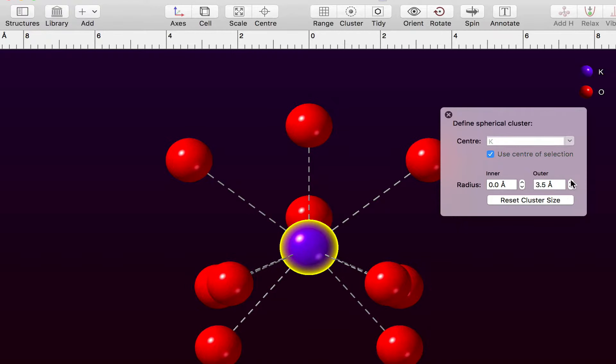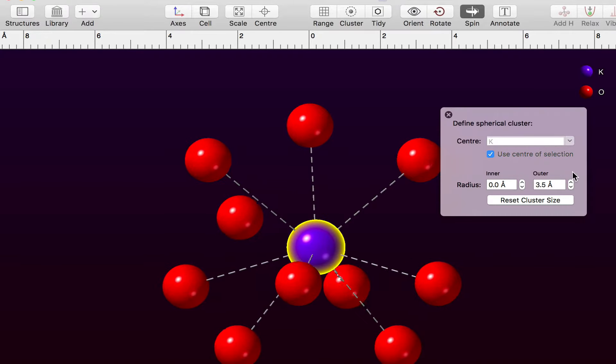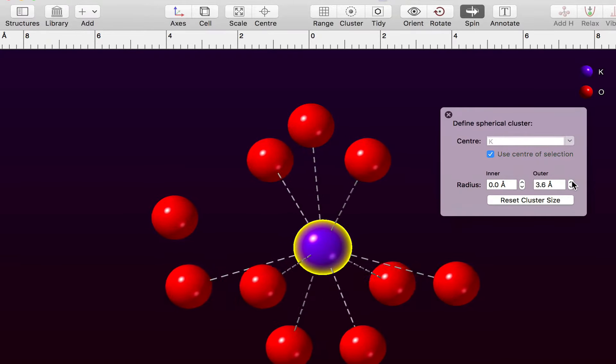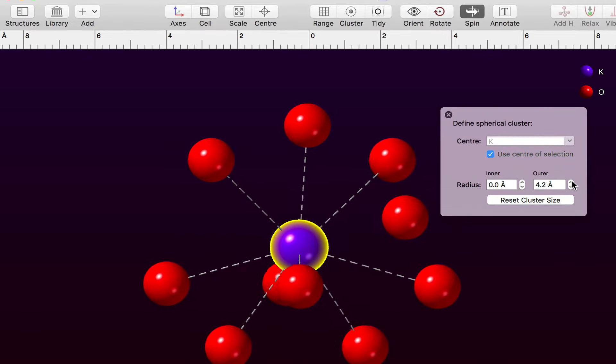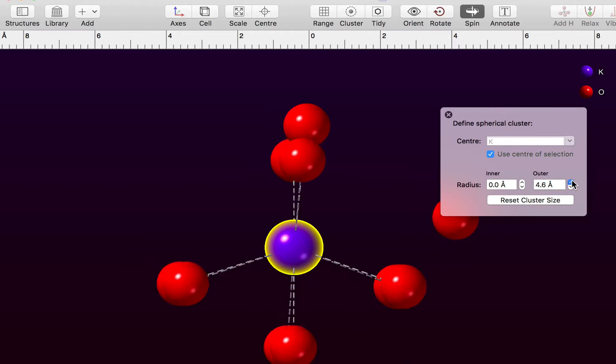So here we have a three and a half angstrom cluster. If we continue to expand the size of our cluster, we'll start to get other non-bonded atoms appearing, including some of the other metal atoms in this structure.